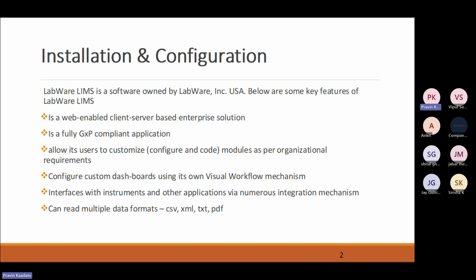When you install, you document all the proof of the installation. You take screenshots of installation steps and then you document it. You approve this document. Whatever activity is going on, there is a history maintained in the application. There is an audit log. There is a log maintained of each and every process, each and every activity performed. Then this particular application becomes a GXP compliant application.